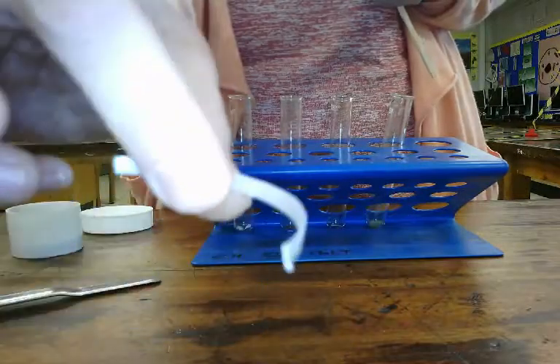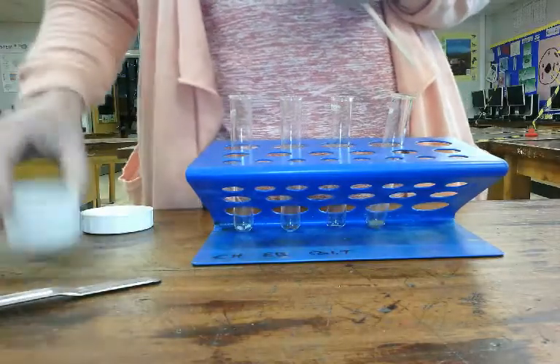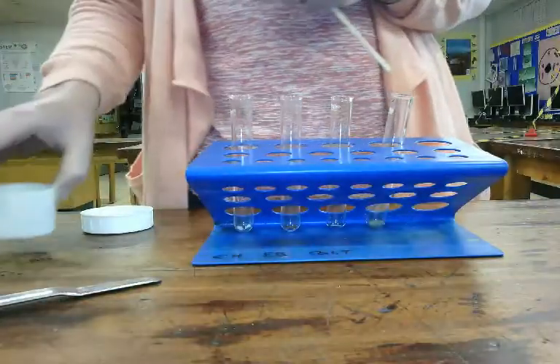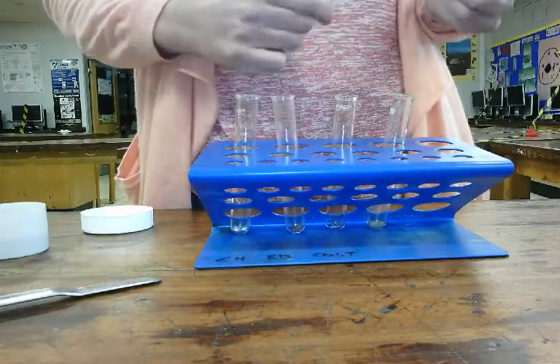which looks like a strip like that. Then I've got copper. Then I've got iron filings, tiny little bits of iron filings. So I've got 4 test tubes here with those metals in.